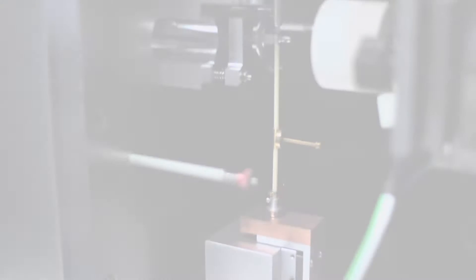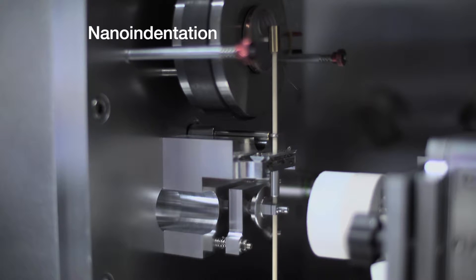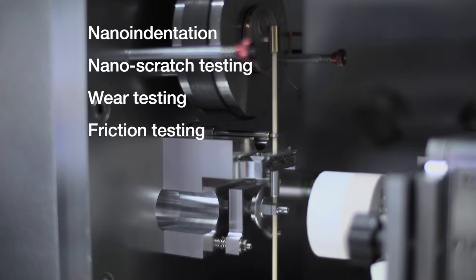The complete range of nanomechanical tests remain available, including indentation, scratch, wear, friction, impact and 3D imaging.